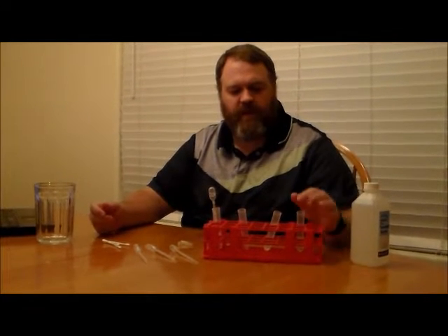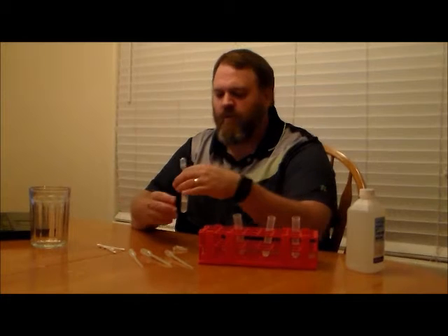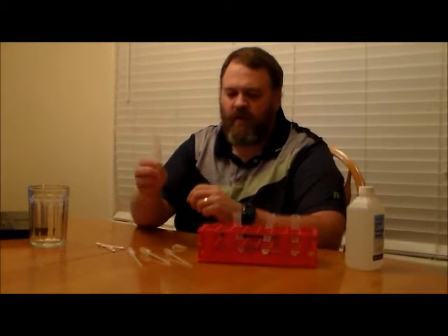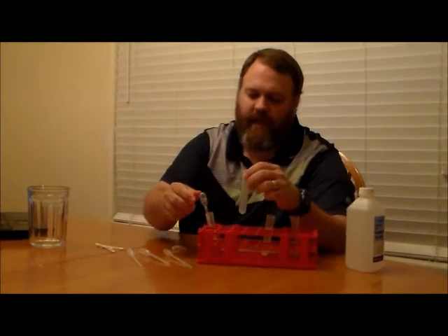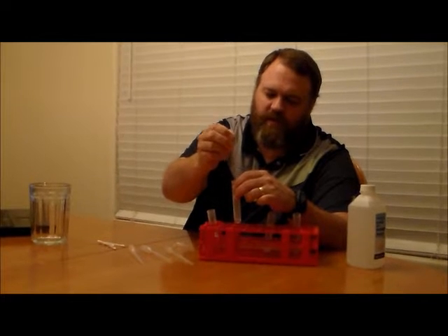All right folks, so we've gathered all of our supplies, mixed up our solutions, and now we're ready to do our extractions. One of the solutions we mixed up was a mixture of water and a little bit of dish soap. We're going to take our test tube previously labeled 'cells' and add about 1 to 2 milliliters of our soapy solution to this test tube.